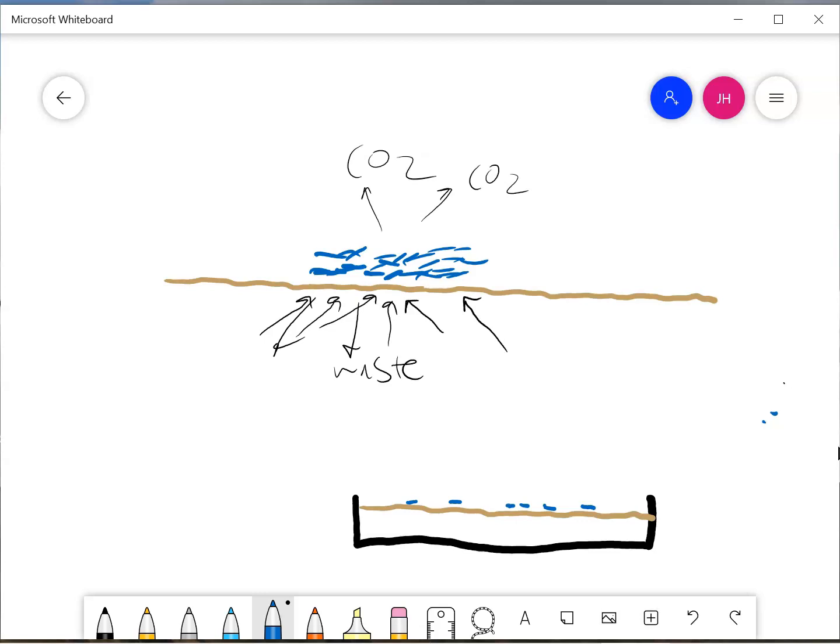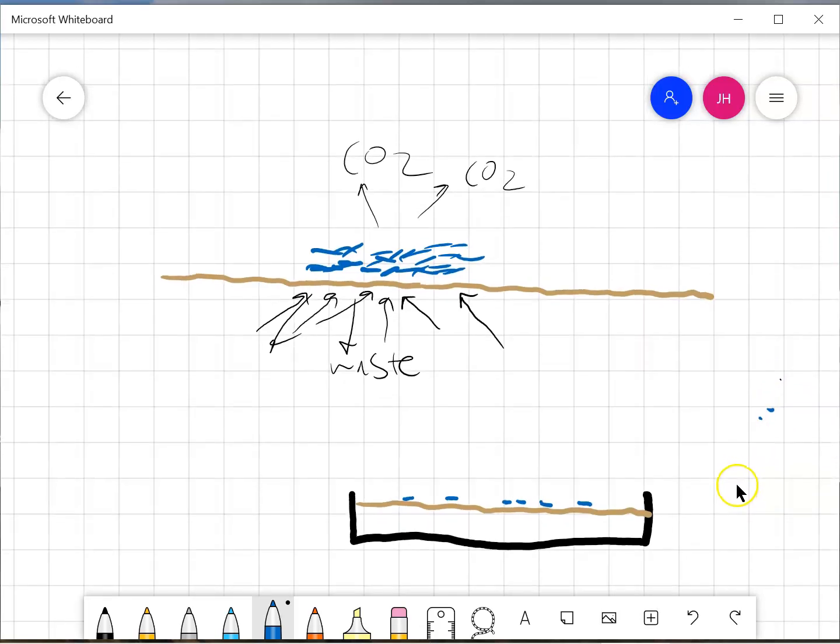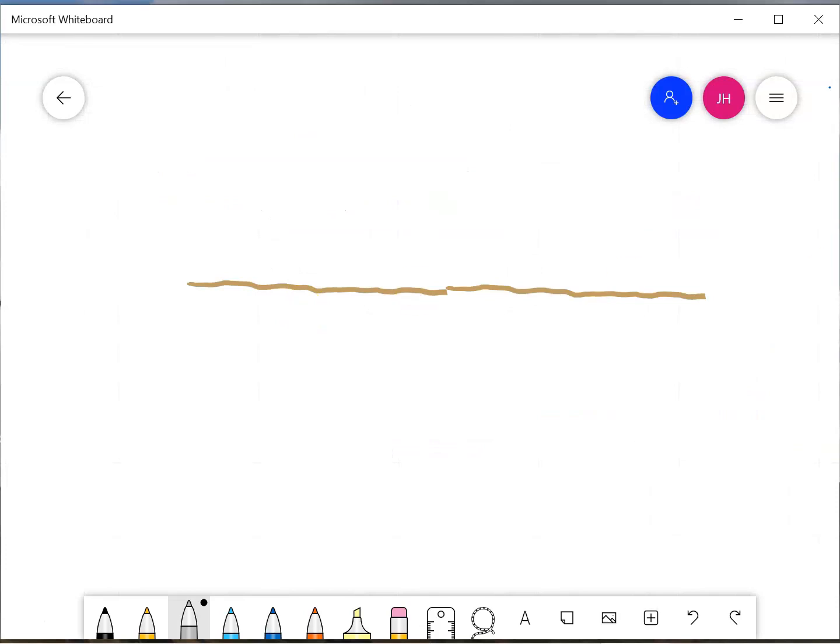Great. So what about viruses? So what about viruses, right? What do they do? Well, remember, a virus needs to grow in a host cell. So if we want to count viruses using a low-tech method in a lab, and this would be one we would do, again, we're going to use agar. Again, we're going to solidify some water with a lot of nutrients in it, but this time we're not feeding the virus. This time we're feeding the host cell.